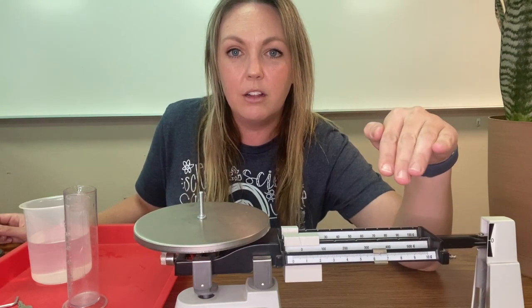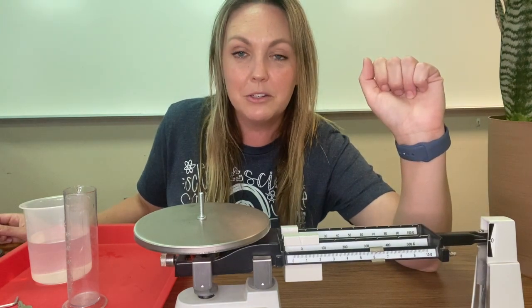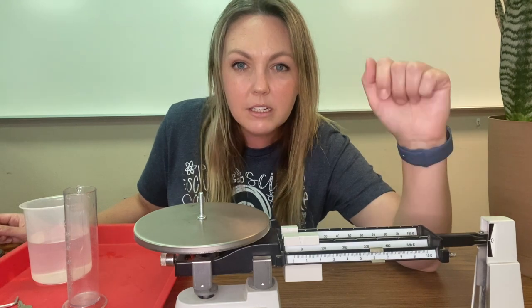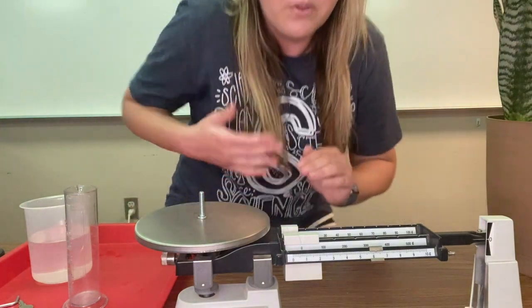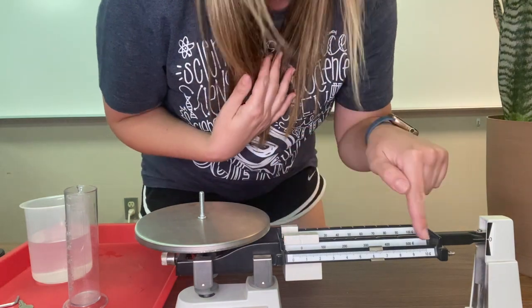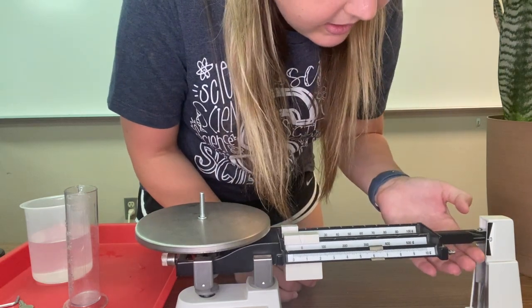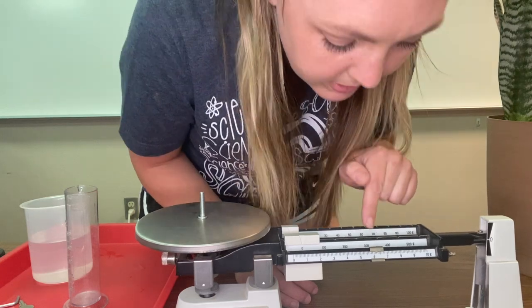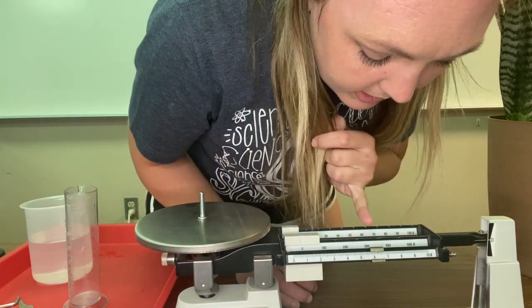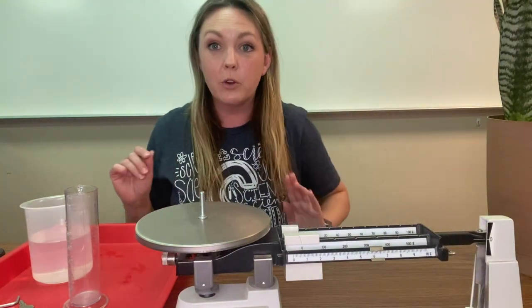You've got to wait and have a lot of patience for it to balance out. Sometimes it's not by much but you've got to move it. That looks pretty even. Reading our triple beam balance — the smallest one goes from zero to ten and there are ten lines in between each. This one measures at six and two tenths grams.